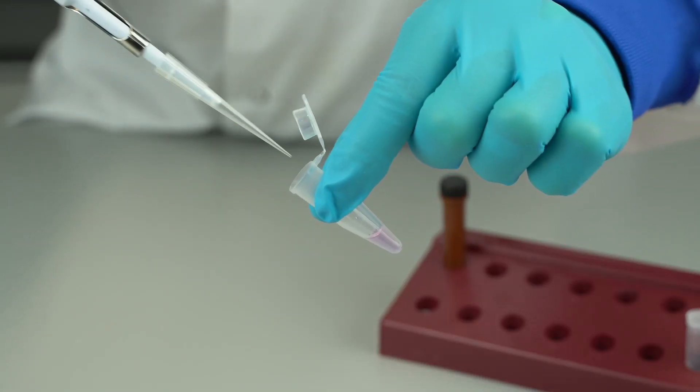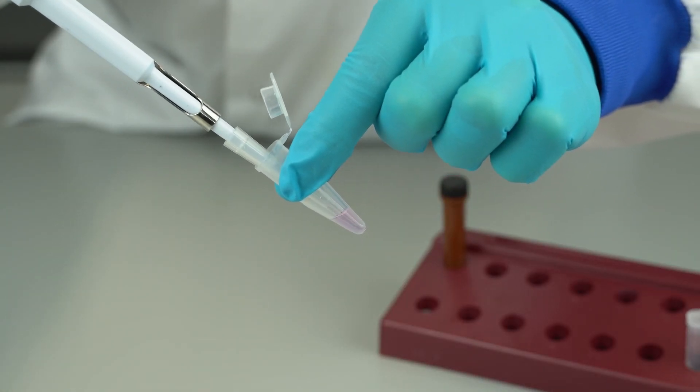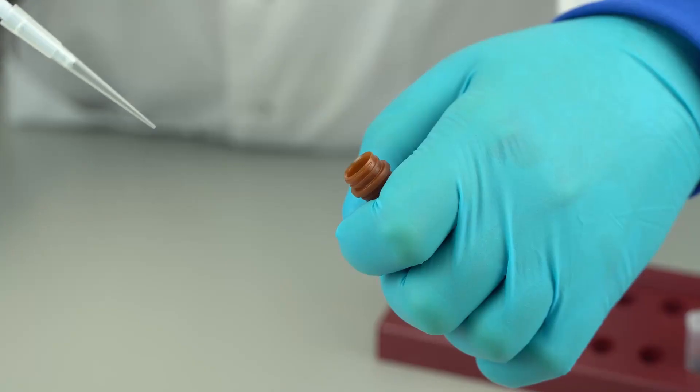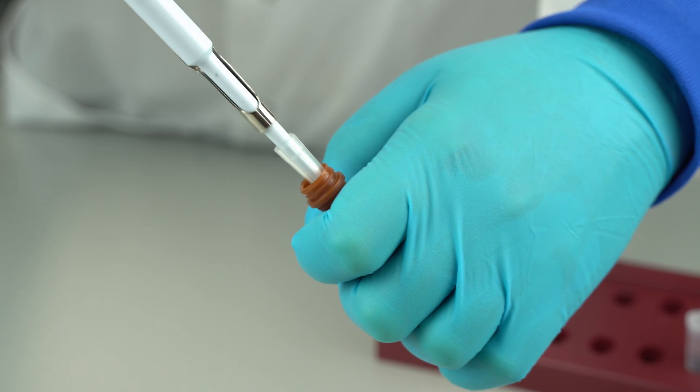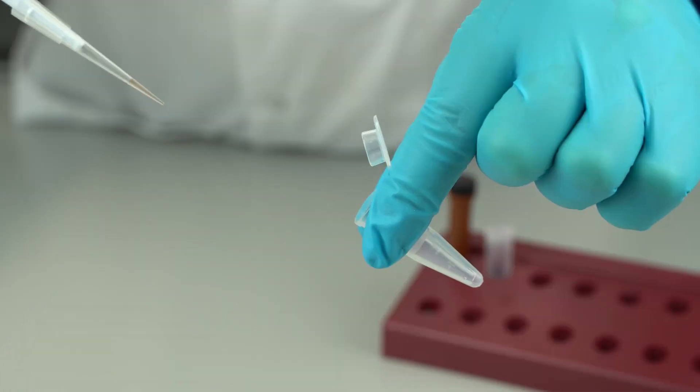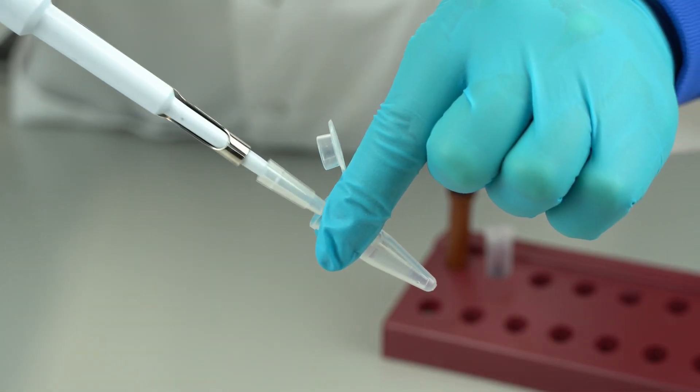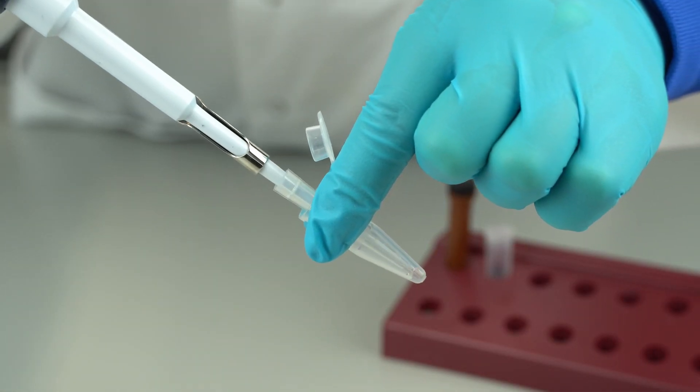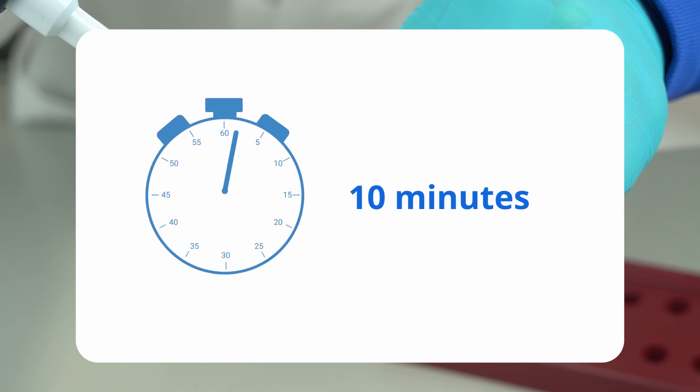Add 10 microliters of the cell suspension to the preferred concentration of fluorophores and mix gently. If necessary, let the sample incubate for up to 10 minutes.